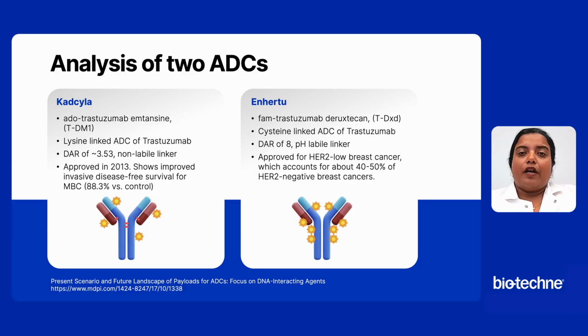This study was conducted on two trastuzumab ADCs, Kadcyla, having a non-cleavable thioether linker, and Enhertu, which uses a cleavable tetrapeptide linker to conjugate a topoisomerase 1 inhibitor.